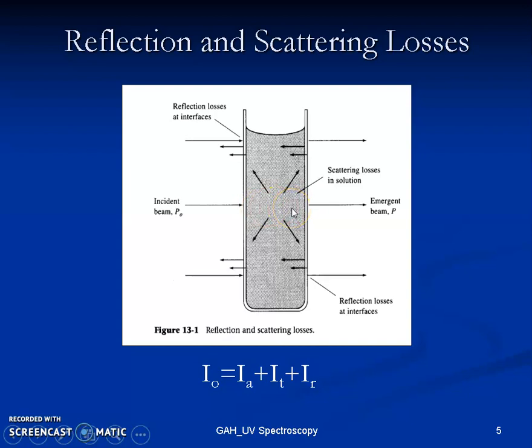And Beer's law is, again, with respect to the intensity of the incident radiation and the rate of decrease in the intensity with respect to the thickness, along with the concentration of this absorbing medium. He has added only one additional term, which is the concentration of these absorbing species.